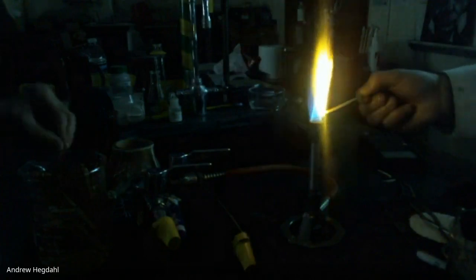Okay, this one's really sparky. We had that earlier one that was sparky, but this one's way more sparky. It has kind of a yellow flame with lots of sparks, and there's some hints of green in there too. Yellow green. That was letter H. So now we're on our last one here.